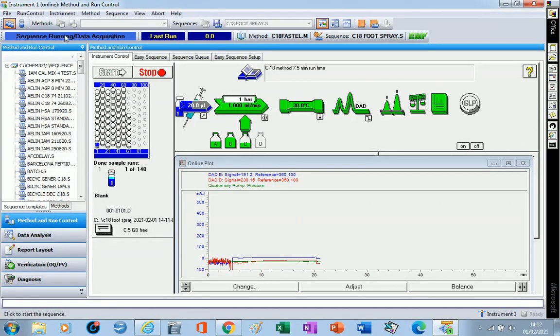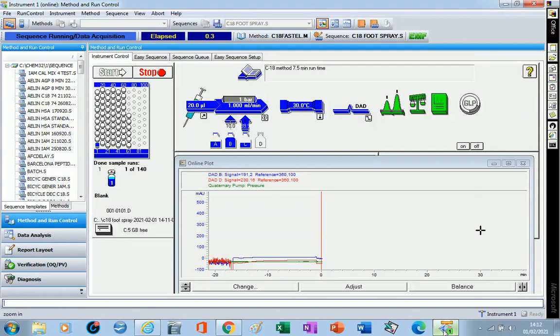This single wash washes the pump pistons on the back. I usually do it before the run and after the run to ensure that the buffer and the salt will not crystallize out in the piston. So that's all. Now I stop recording.